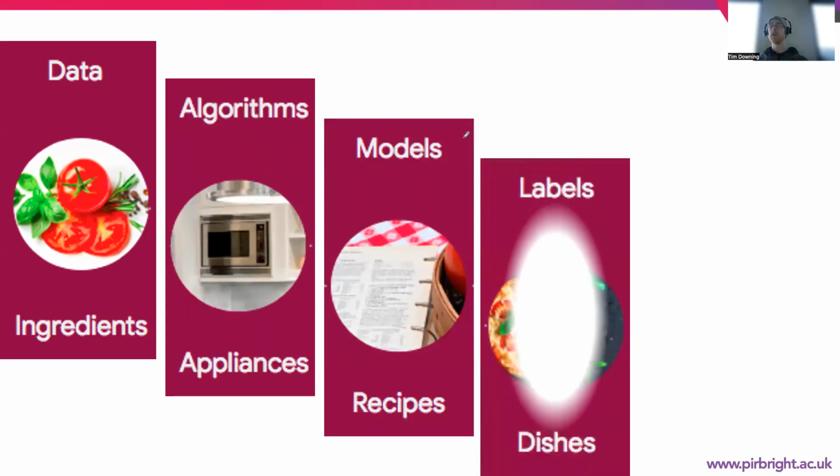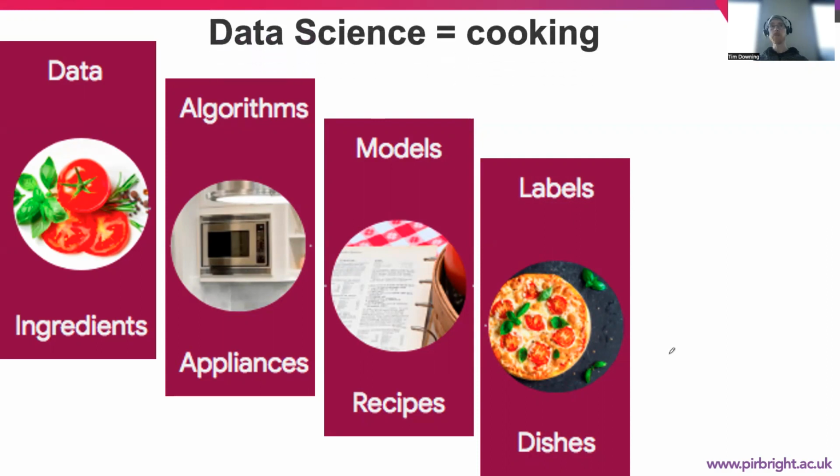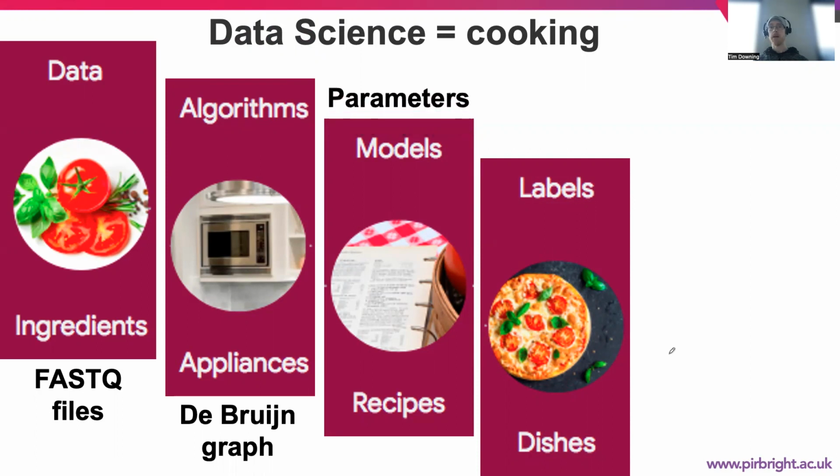And that will ideally give us a good assembly at the end, but you might find that your data does not actually assemble well. That might depend on our initial ingredients. If you have poor ingredients, it can be hard to get to the desired outcome at the end, even if we try our best. So that's kind of where we're at. We have these FASTQ files, and then we have our tools that apply the De Bruijn graph approaches, and then we ideally get our assembly at the end.